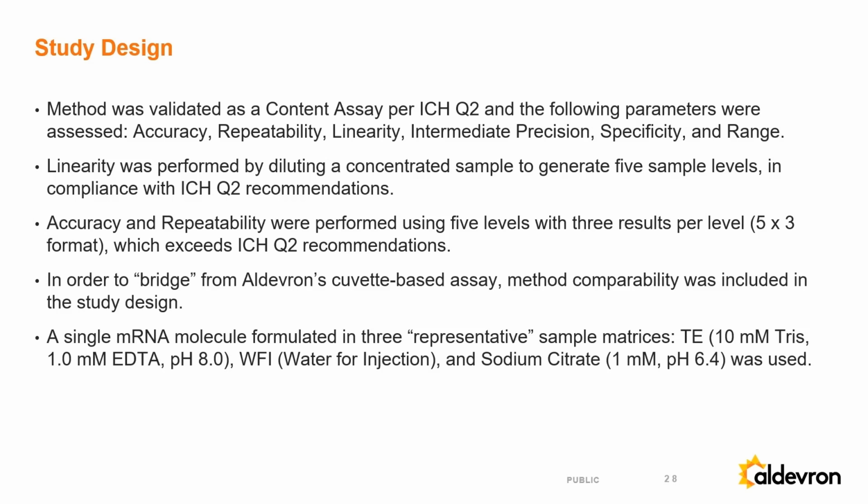One of the aspects of this particular qualification, or validation, was that we built in a bridge to Aldevron's existing cuvette-based UV concentration assay. Coming out of this study, we demonstrated with these data that the methods are very comparable. To Joe's point, at the end of the day, it's A260 measurements.